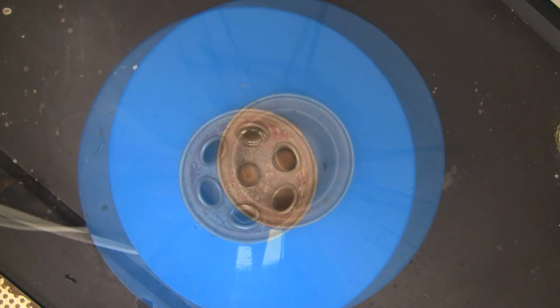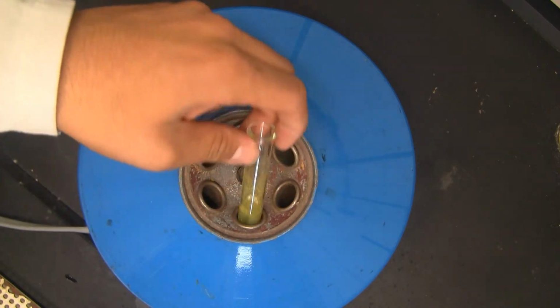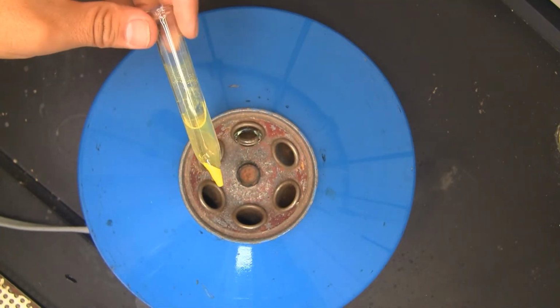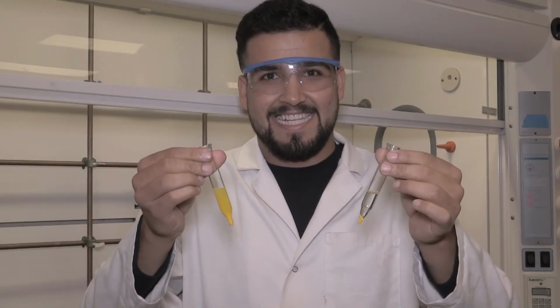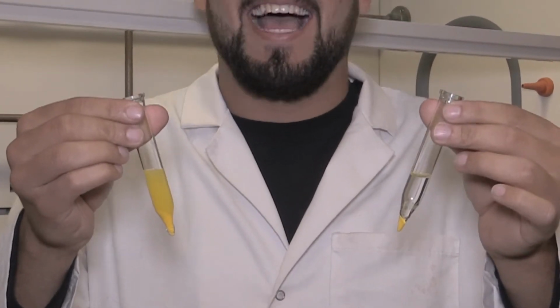Good show! The centrifuge has collected the precipitate in the bottom of the tube. Why is Solomon happy? Because now he can quickly pour off the supernatant solution and separate the solid from the solution.